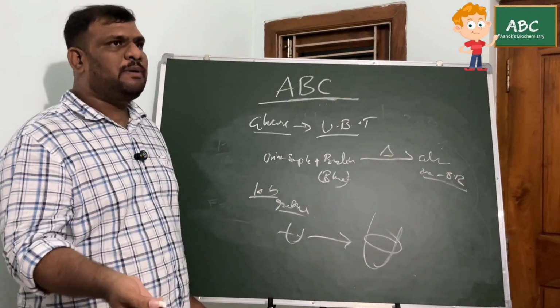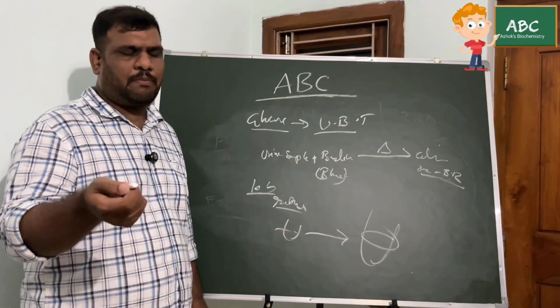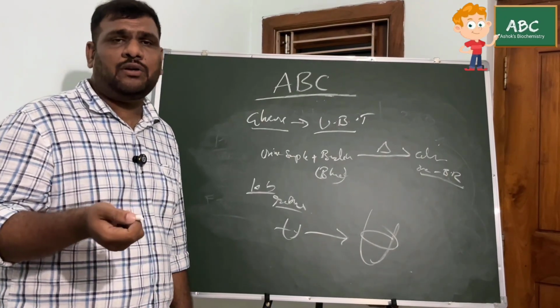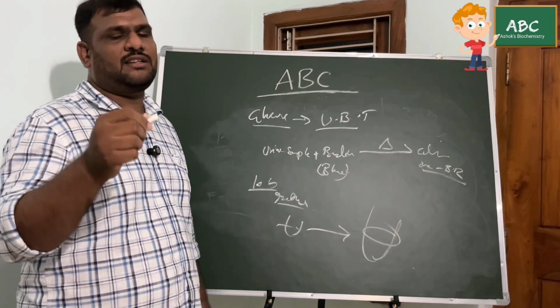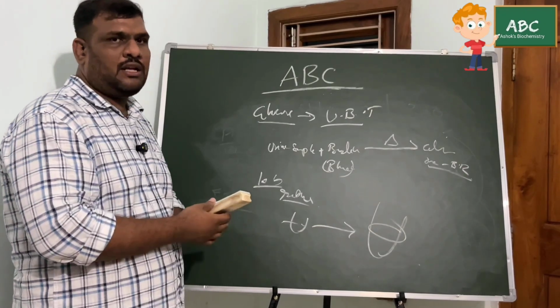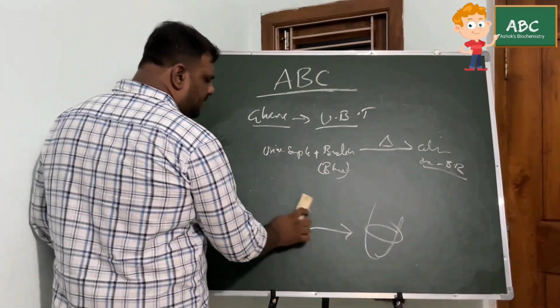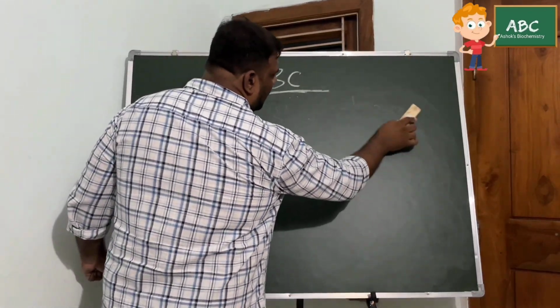When it comes to the bile pigments, when you do the filtration, the residue will be on the filter paper. On the filter paper, when you add Fouchet's reagent, you can see a greenish color change. By that you can identify that the bile pigments are present. With this, you can manage the qualitative analysis best. A detailed video of this will be continued.